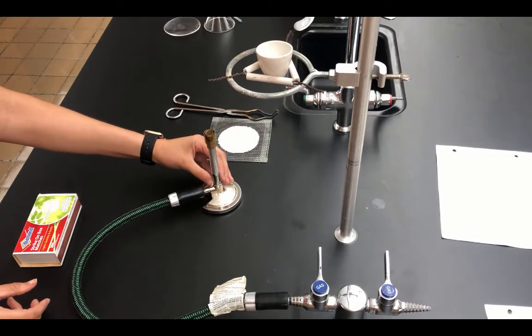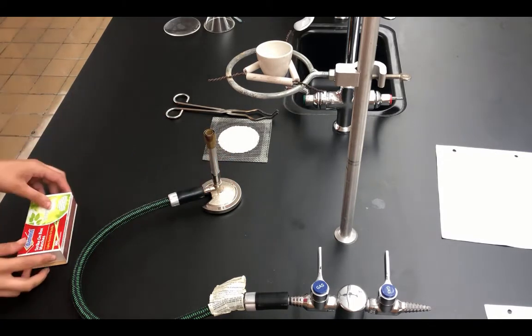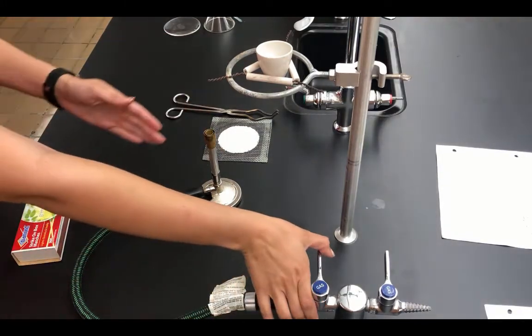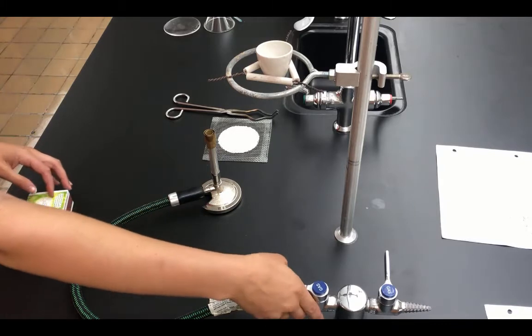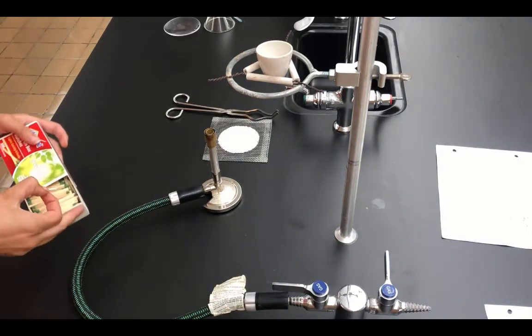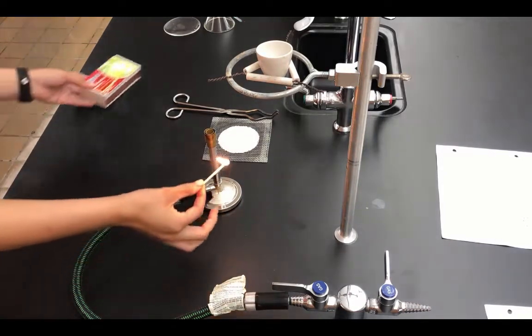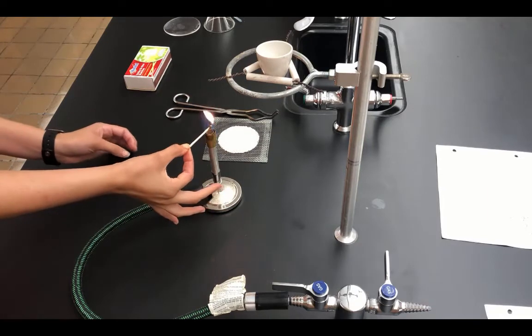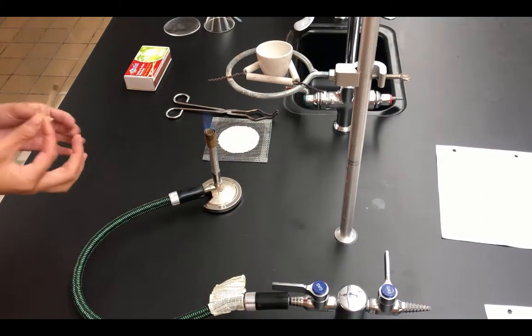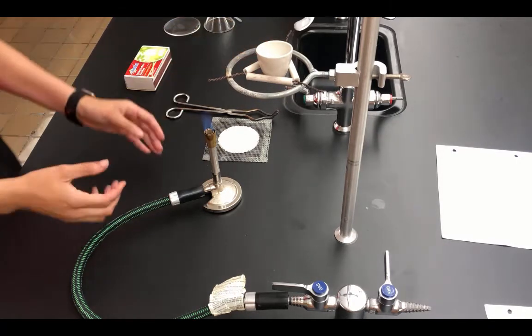Now what I want to make sure to do with the Bunsen burner is close the vents first, so that we have all of the gas that we will be igniting. I'm going to turn the gas on so it is parallel with the hose. I'm going to take a match. When I light a Bunsen burner, I want to come up from the bottom. You do not want to go top down because you'll burn your hand. I'm just going to set this off to the side so I can rinse it with some water.